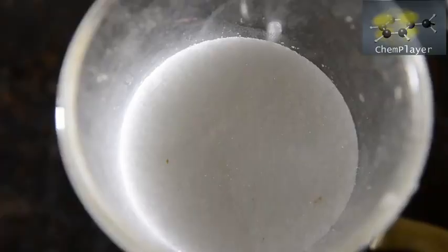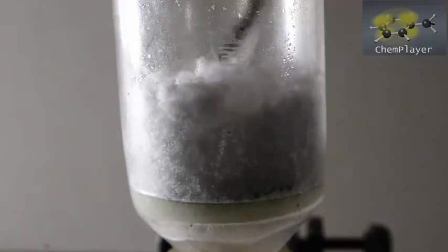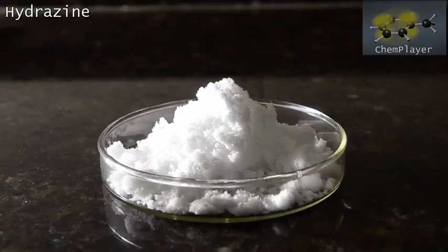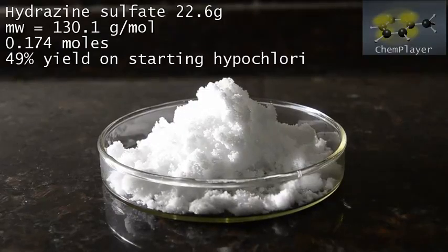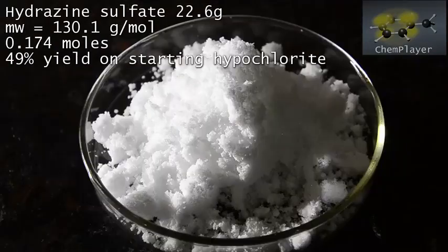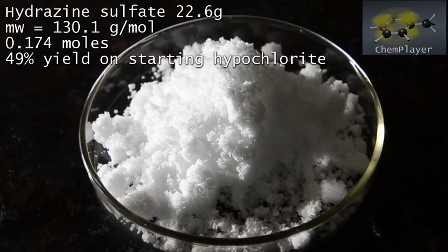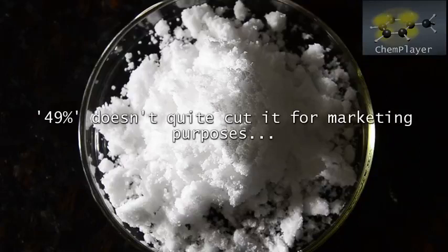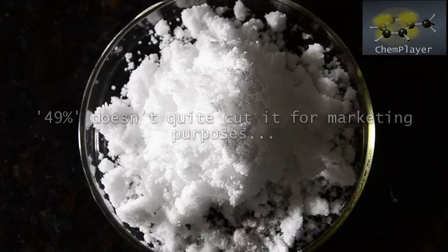Dry the product really thoroughly on the pump until it's light and fluffy. Here is our final product — 22.6 grams of hydrazine sulfate as pure white dry fluffy crystals. This is a yield of 49% on the starting hypochlorite, assuming the solution was at the strength written on the label. This is not bad at all, and the alternative ketazine process typically gives about the same sort of yield. But do know that the reaction we've shown you here is not forgiving when it comes to purity of reagents. We really wanted to claim a yield of over 50% for this method, and 49 doesn't quite cut it — but we do have a final trick up our sleeve.